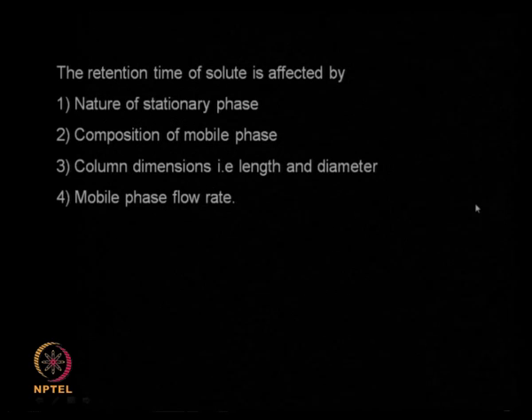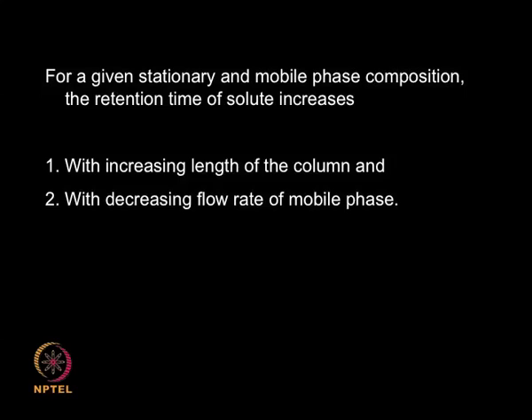Column dimensions: what is the length of the column, what is the diameter of the column, and finally the flow rate of the mobile phase, how fast or how slow the mobile phase is flowing. So all these parameters affect the movement of my solute through the column.